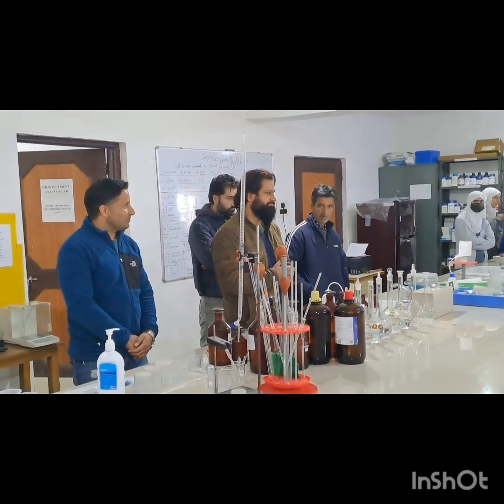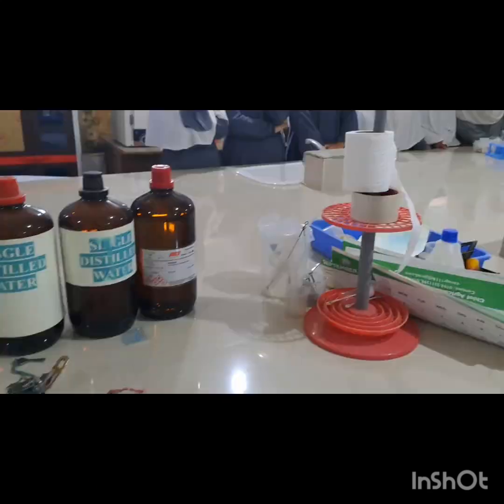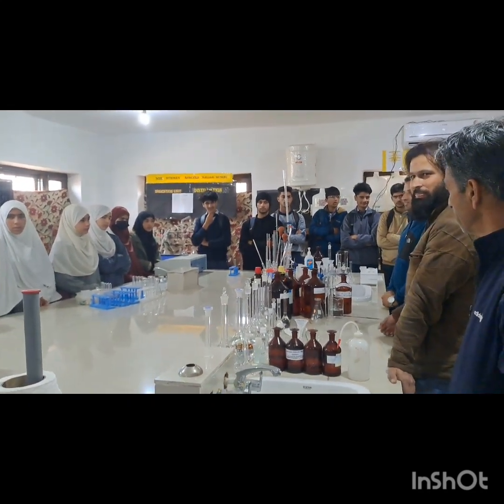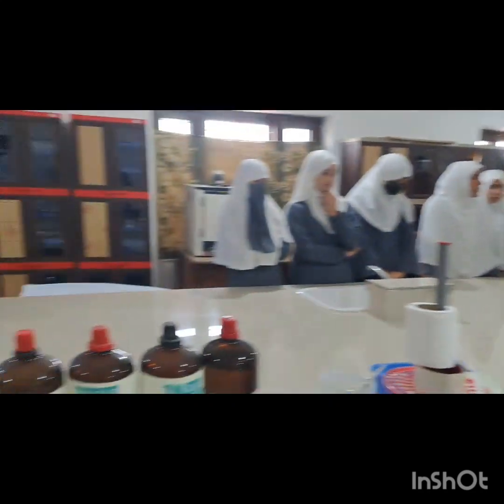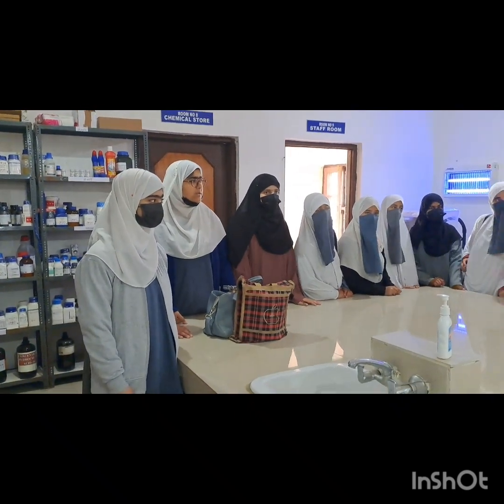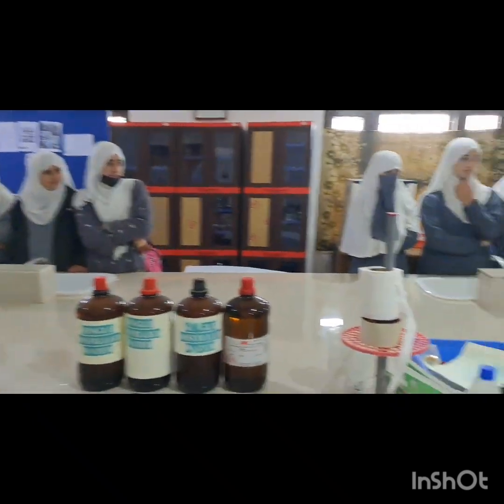2. Demonstration of soil sampling techniques. Students observed the process of collecting soil samples for testing. Lab technicians demonstrated the appropriate methods to collect samples from various locations and depths to ensure accuracy in test results.